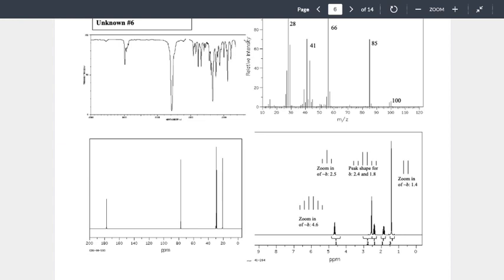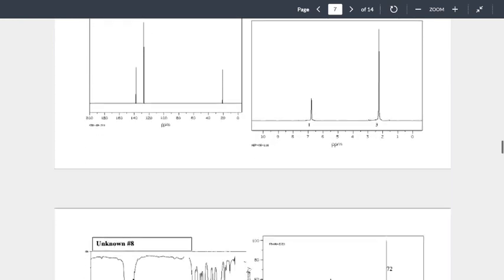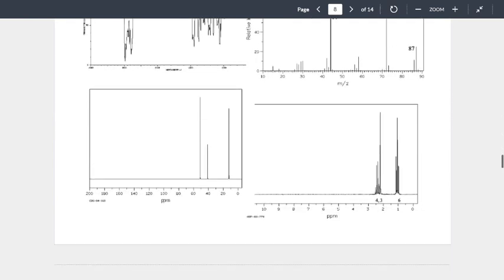Sorry, we're seeing complex splitting patterns here, and I'm now trying to wrap what you were telling me around that. Different argument. Underneath, all written out. A couple people got confused by the comma. Why is there a comma there? Because this isn't 43. This integrates to 4. This signal integrates to 3. I'm just trying to make sure that people see that as separate signals. That's the intent. Does that make sense?